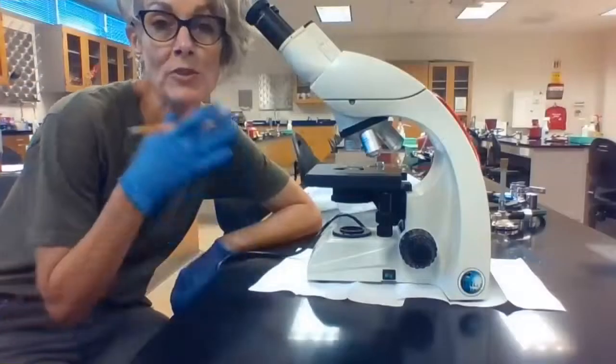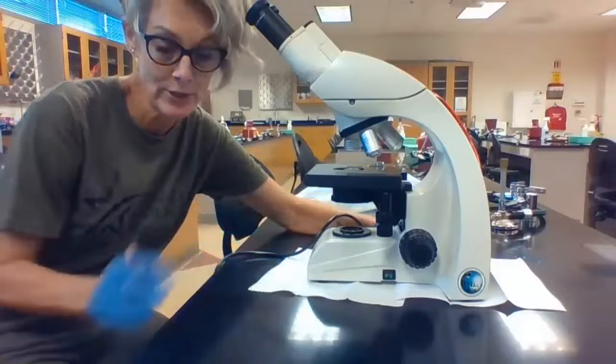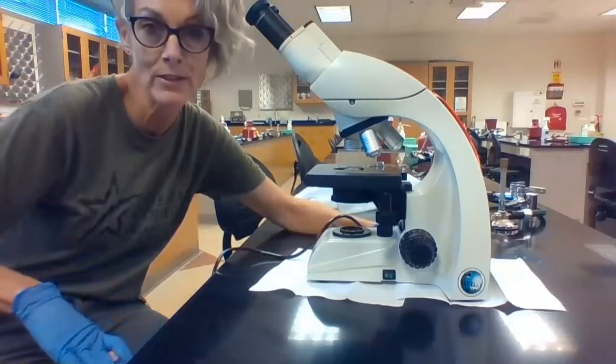Once you get your microscope safely to your workspace and on the mat of paper towels that you've prepared for it, you're going to want to plug it in. The plugs are right here on the edge of your lab bench.